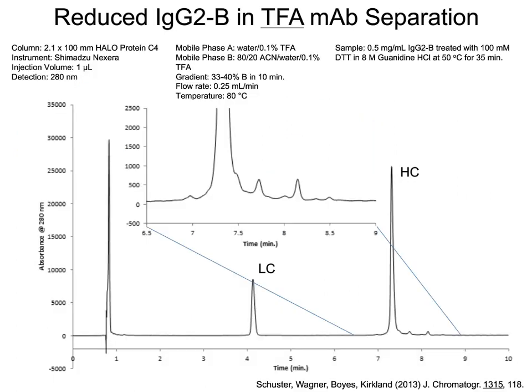We can also apply some of these improved separation conditions and materials to look at the subunit composition of monoclonal antibodies.